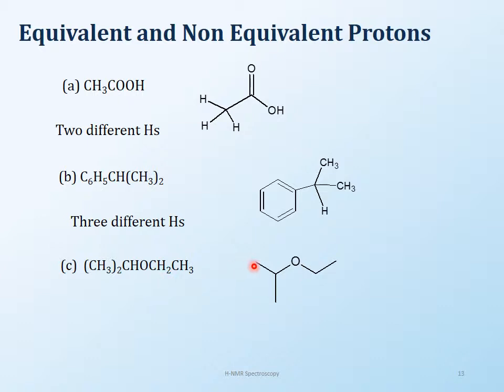Okay, so once you know this, then this CH3 and this CH3 are alike. There is a hydrogen over here. Don't forget, that's the hydrogen. So 1, 2, 3, 4. Okay, so you'll have 4 signals for this compound. For this ether, this is isopropyl and this is ethyl. So ethyl isopropyl ether, you'll have 4 signals for it.